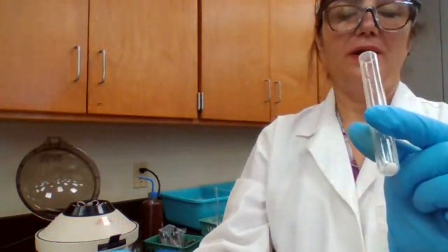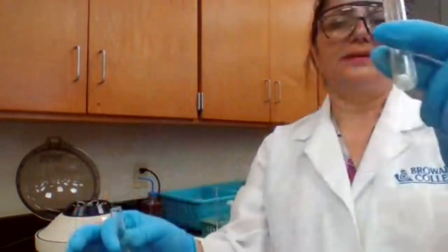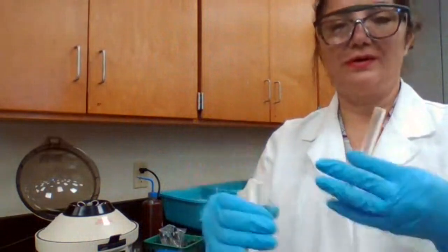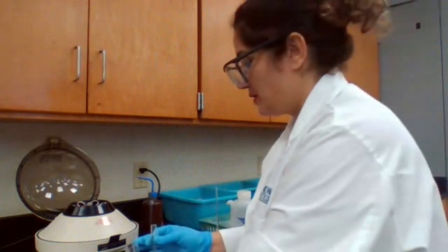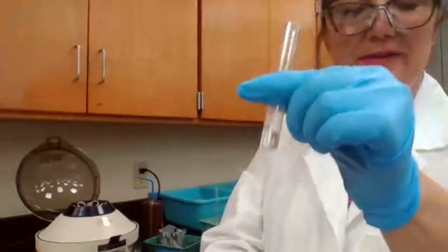If it was unknown, all I can say is there could be lead in the liquid form and solid for silver. So lead in the liquid and solid. This is not confirmed yet, because to confirm it, we have to get a more obvious observation. So for this liquid portion, now I'm going to confirm it.